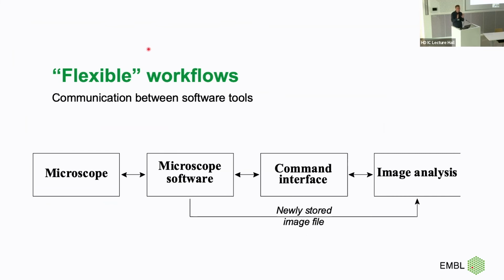So we don't want to control the individual elements of our systems. We want as much as possible the microscope components controlled by the commercial software of the corresponding vendor. So the scheme which we ended up using for multiple different vendors and multiple microscopes is to have the microscope and microscope software provided by the vendor, as we used to have. Normally, if you have the manual workflow, the user will interfere somewhere here, just to control the microscope and to acquire the images. So instead of acquiring images manually, we want to acquire the images automatically.